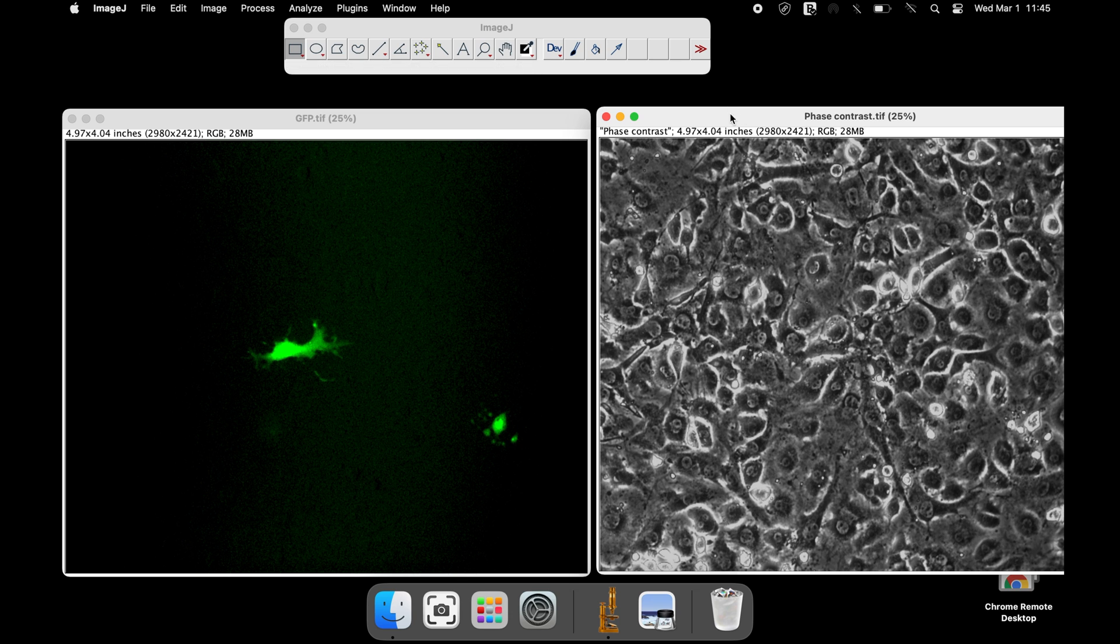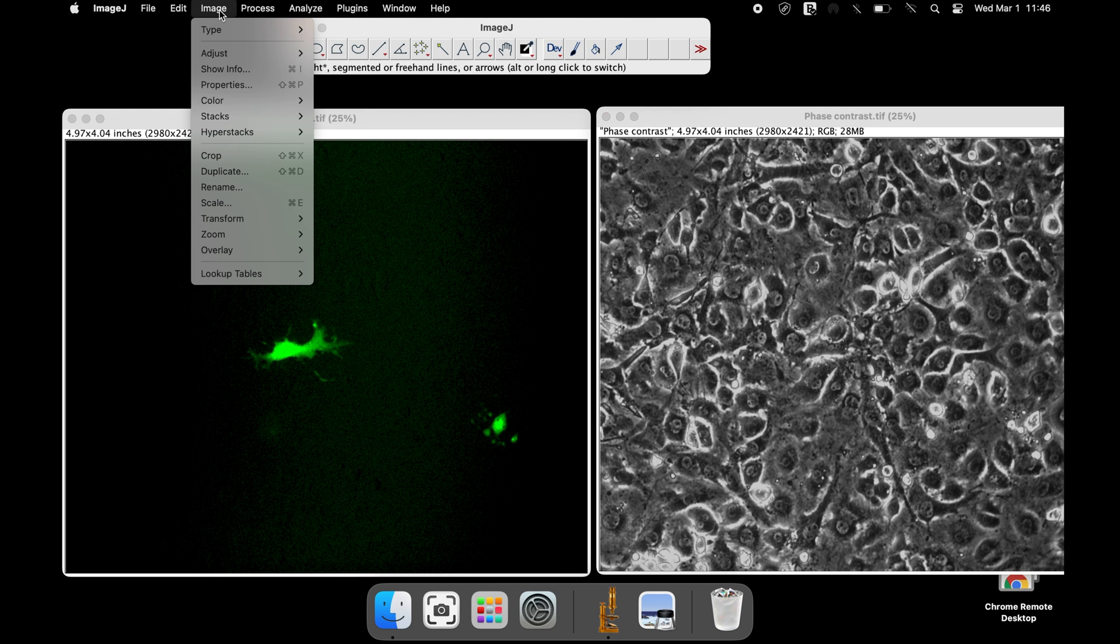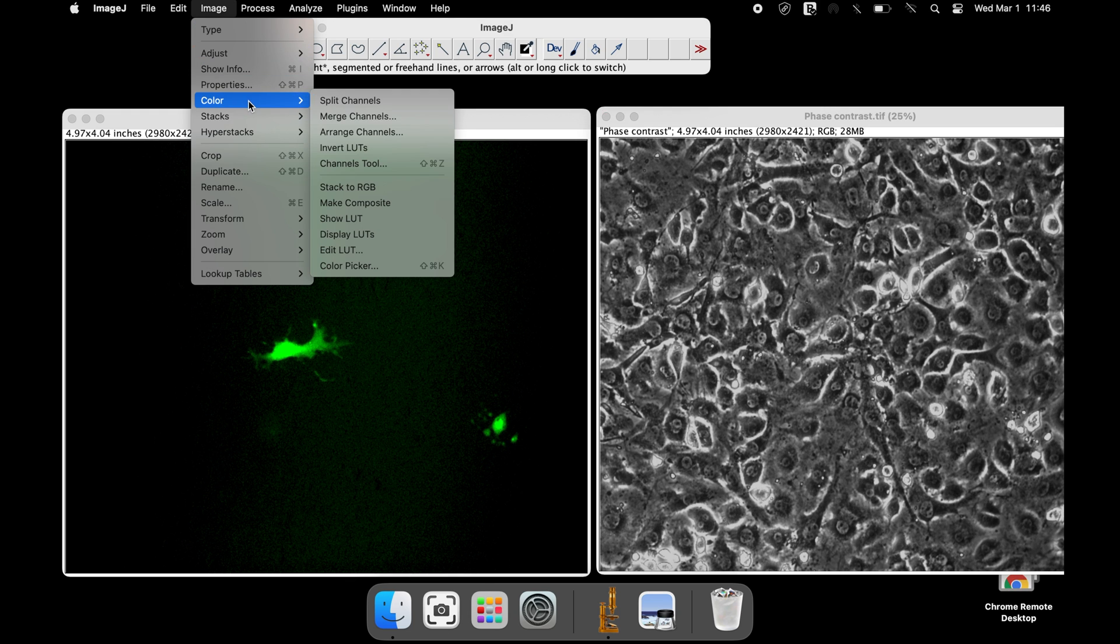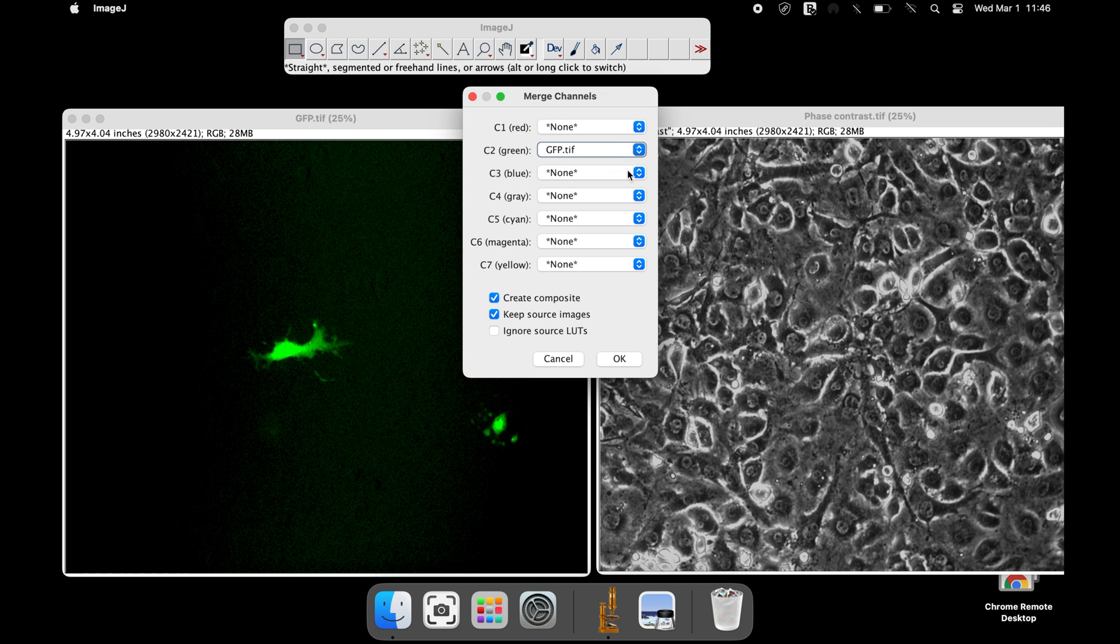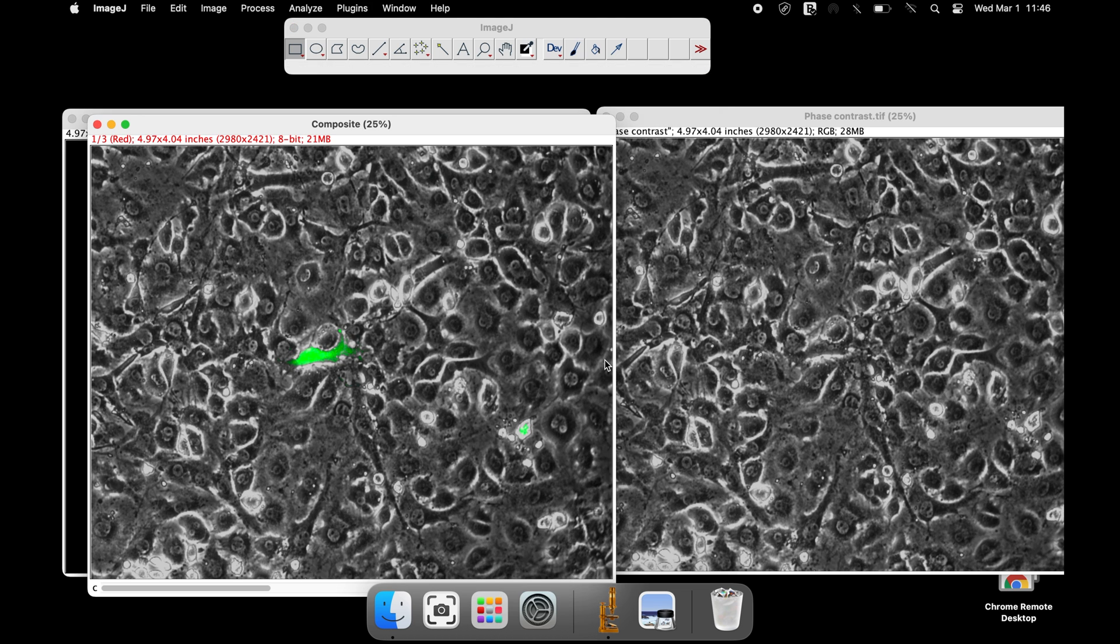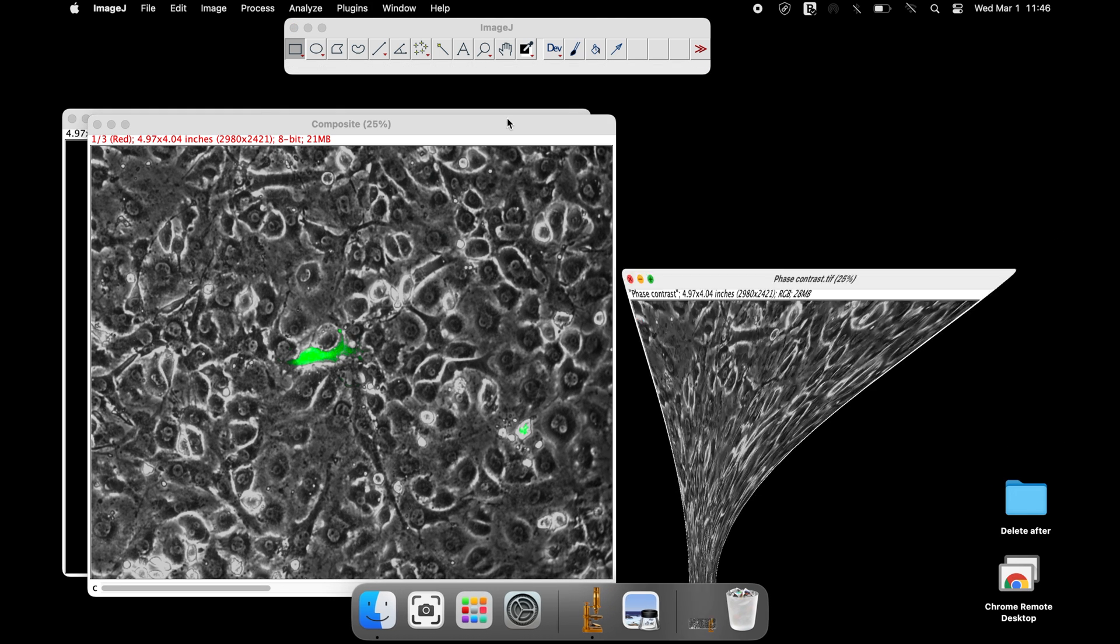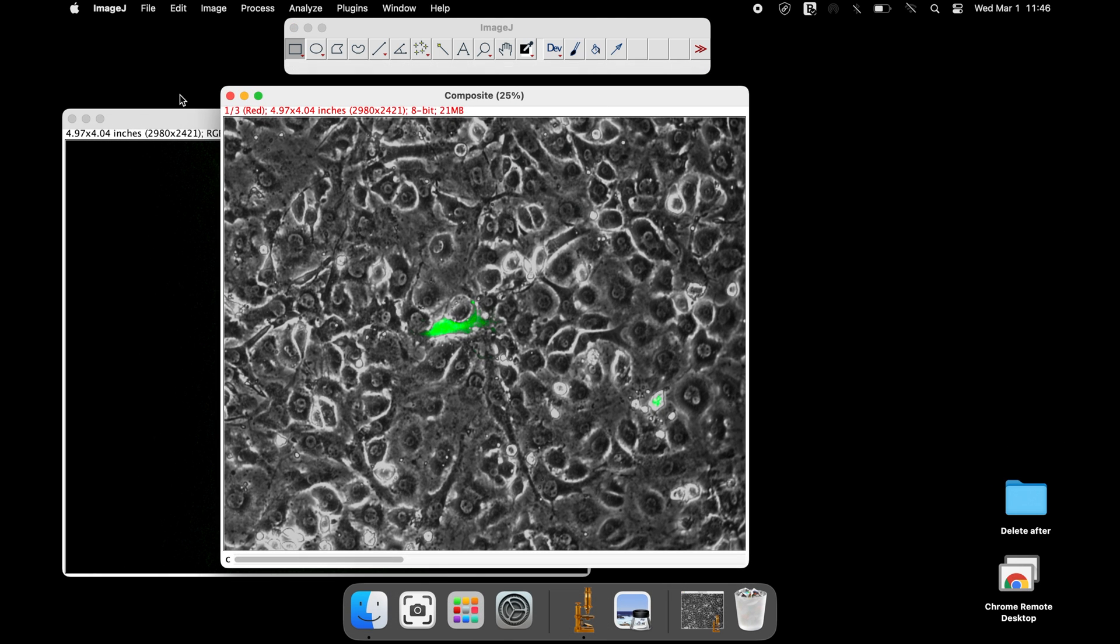Since the image sizes are same, the merging of these images can now be performed. Click Image, Color, and Merge Channels. Select the appropriate channels for the images and click OK. Now the images have been merged.